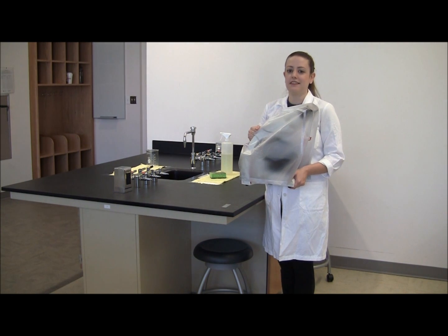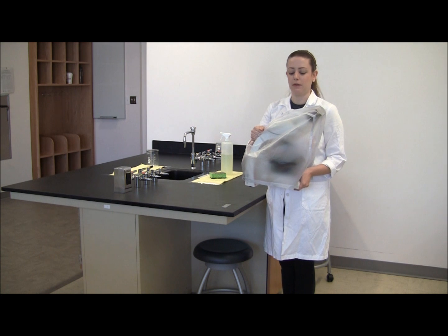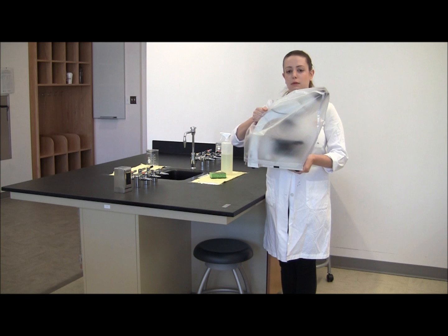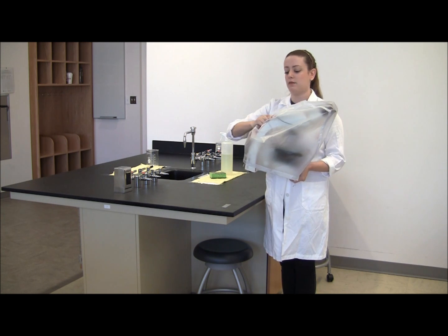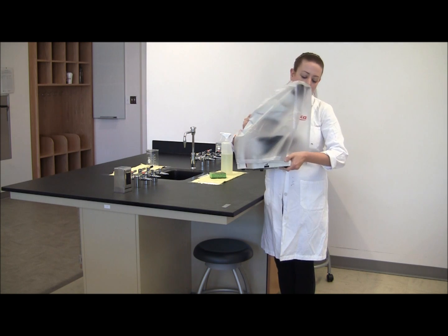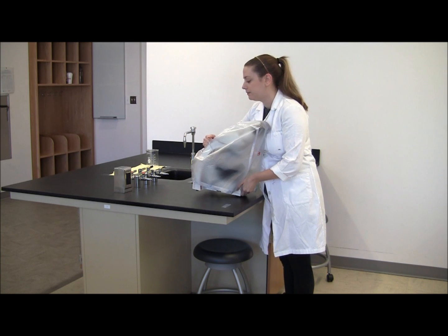Once we have stained the slide, we're ready to look at it under the microscope. The microscopes are located in the back of the room in the whiteboard cabinet. The proper way to hold the microscope is by grasping the handle, the red handle on the back side of the microscope, and holding under the base of the microscope.